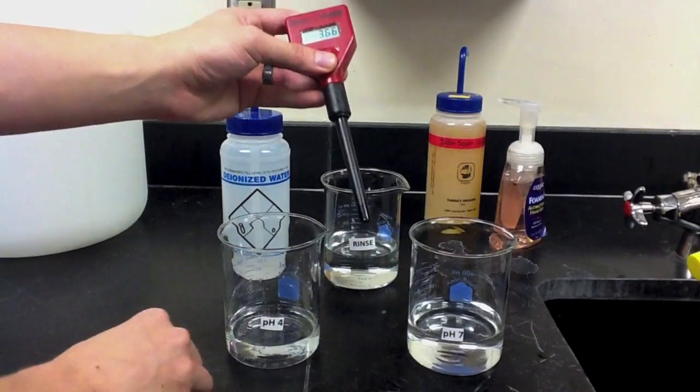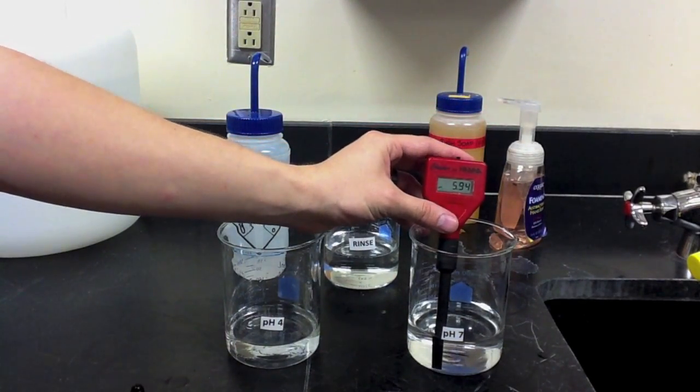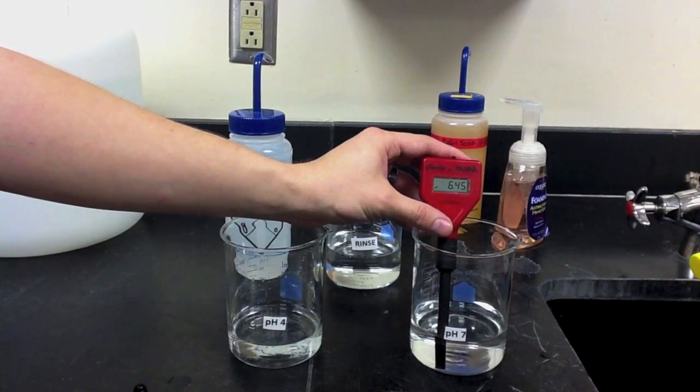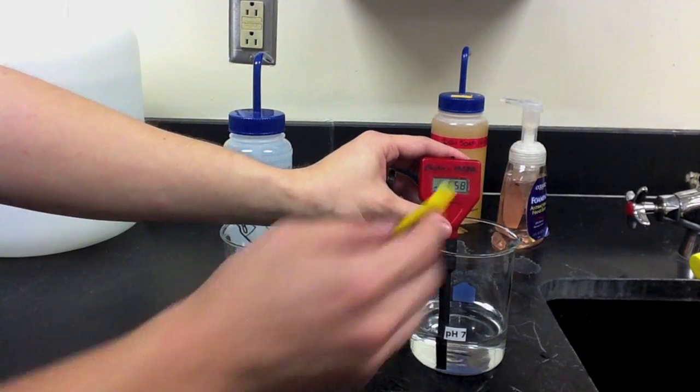Once the electrode is exposed, we can now place it into the pH 7 buffer. Using a screwdriver, we can adjust the pH 7 screw so that the meter is now calibrated to 7.